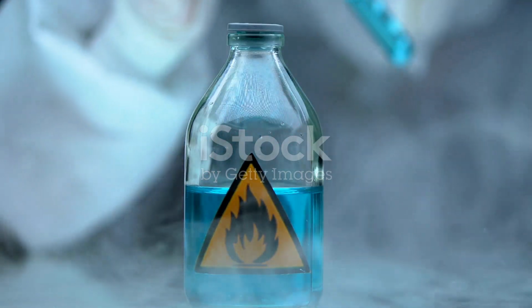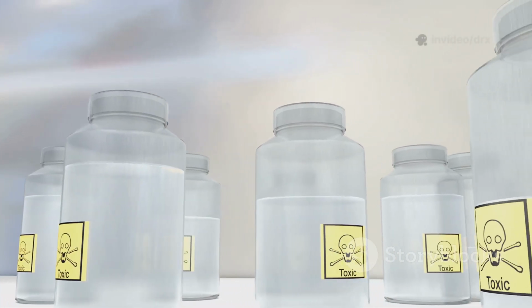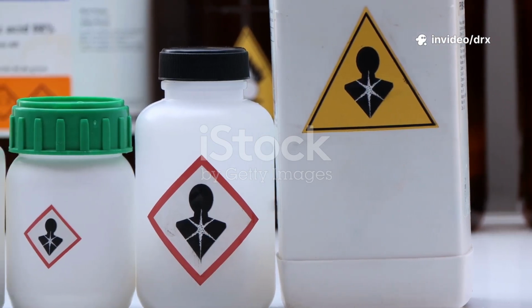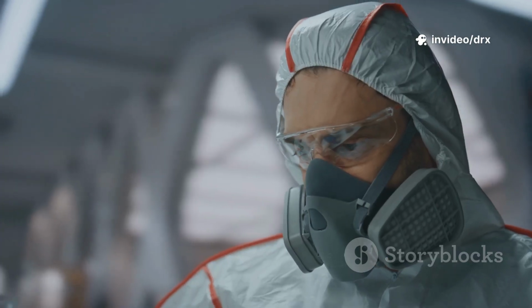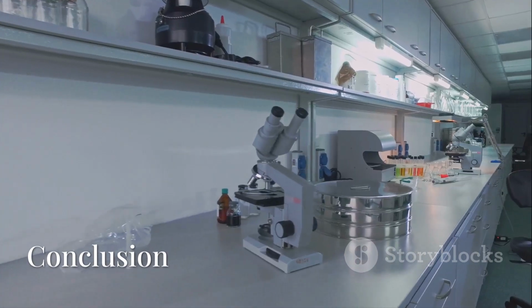But of course, there are some limitations too. Organic solvents used in this method may be toxic, and they can be quite expensive and flammable. You have to take more precautions, and sometimes the indicators may be unstable.